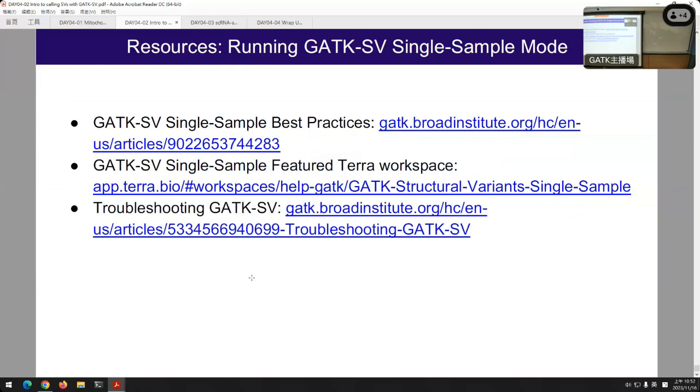Following the previous gentleman's question, is GATK-SV able to detect functional translocations such as fusions that can be implicated clinically? And if it is not the best solution, what other algorithms or tools are recommended for this DNA-based sequencing method? Thank you. Yeah, so GATK-SV should be able to detect the translocation itself. SV annotate does not currently annotate gene fusions as one of its predicted functional consequences, but that's something we're really interested in trying to add in the future. I don't know when that would be, though.